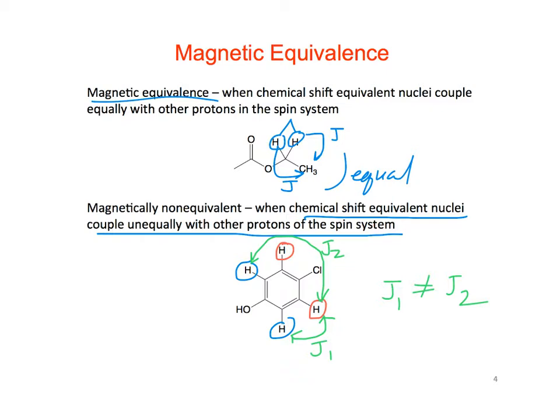And this causes what we're just going to call second order effects. We already talked about some second order effects when the chemical shift difference becomes small or close to the same splitting as the coupling constants, right? And the outside peaks dropped off and pointed to the inside, and if they got too close together in chemical shift, then the number of peaks could even get changed.